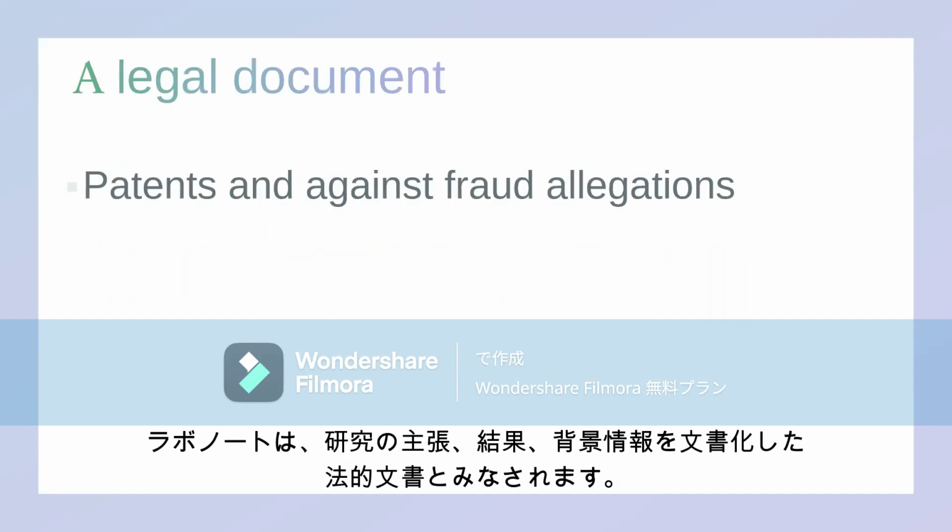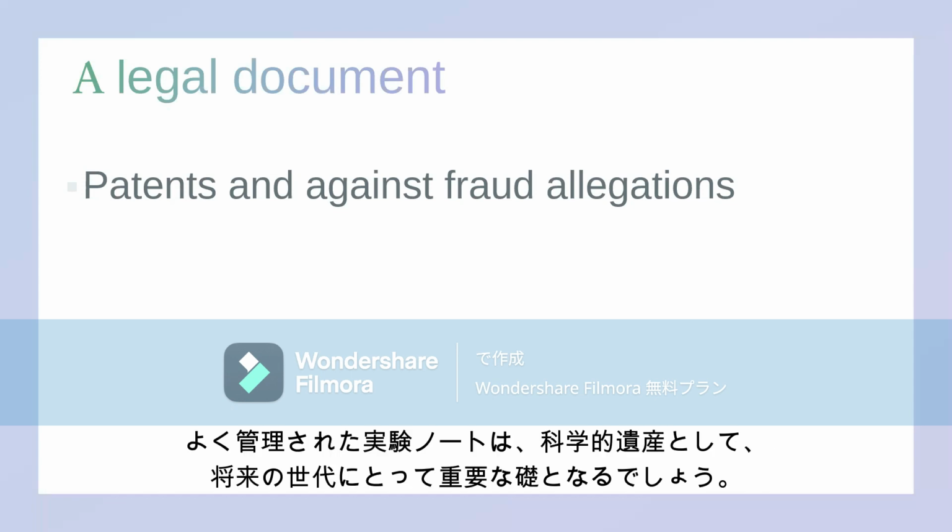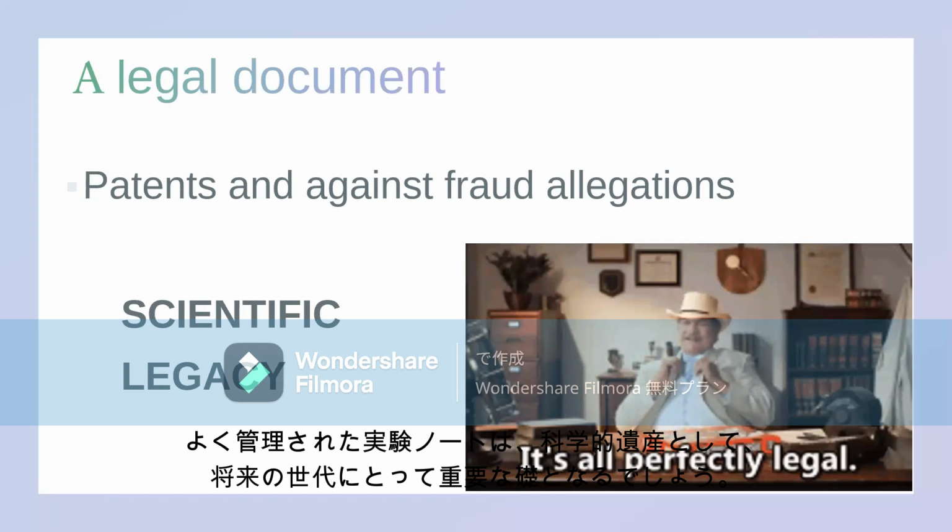It can even be considered a legal document that records the research claims, results, and background information. It is crucial for patents and defending against fraud allegations. A well-maintained lab notebook serves as a scientific legacy, allowing future generations to build on your work.